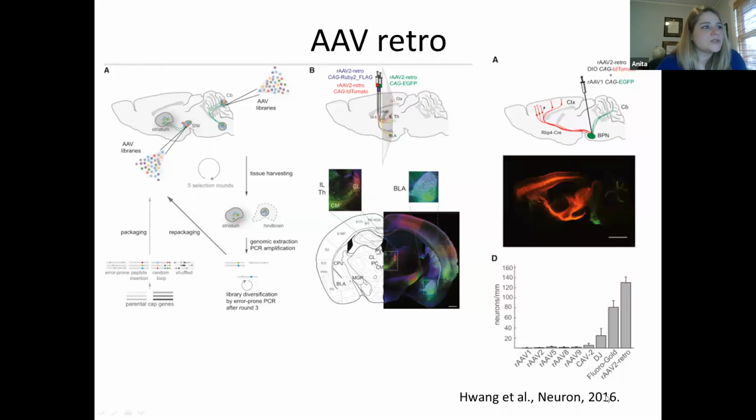And so essentially this paper from Janelia researchers in 2016, Alla Karpova and Lauren Luger, they basically developed a bunch of different AAV2s. Again, they're based on the AAV2 backbone. The capsid has just basically been mutated until it has preferential uptake. So basically, I have tried retros, and the retro works, but a Cre-dependent retro does not work, and we can talk about that more in some other future lectures.